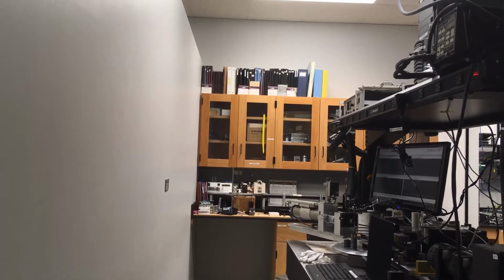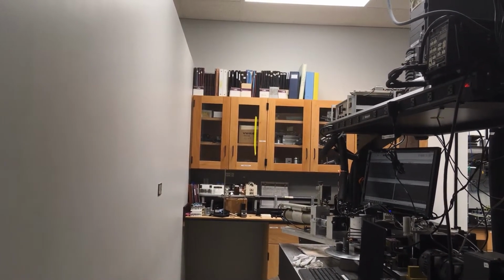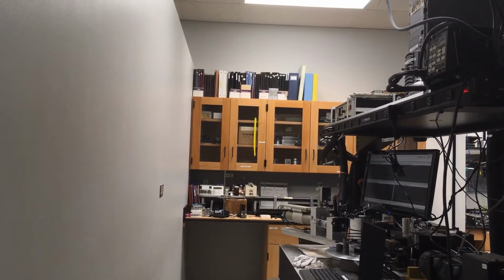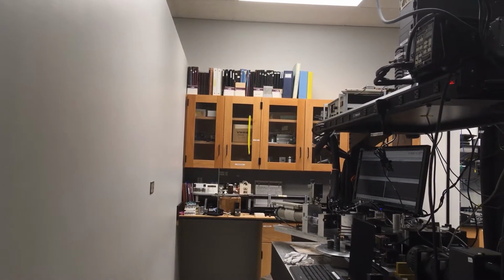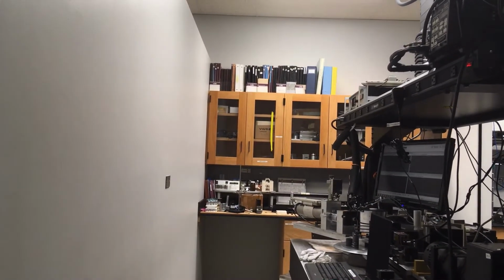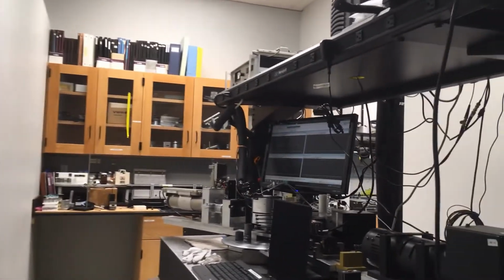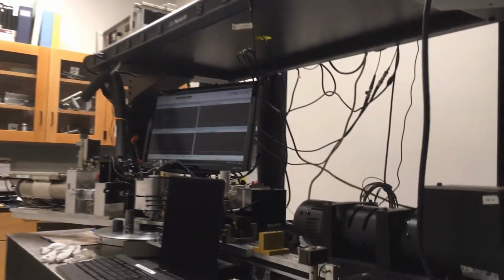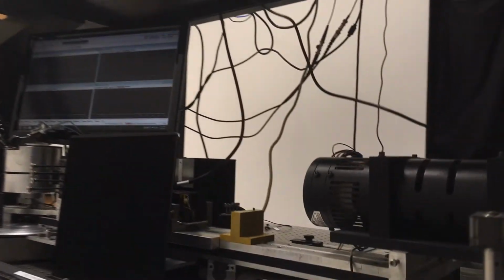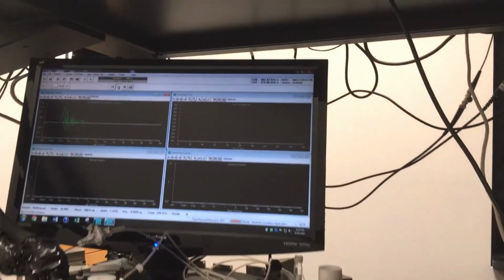Welcome to the lab, and we are going to do a walkthrough past one instrument and towards a very special instrument that is going to be doing a zero-angle depolarized measurement of cellulose nanocrystals in suspension. So the instrument we're walking past now is a conventional dynamic light scattering spectrophotometer. And there is its correlator screen.